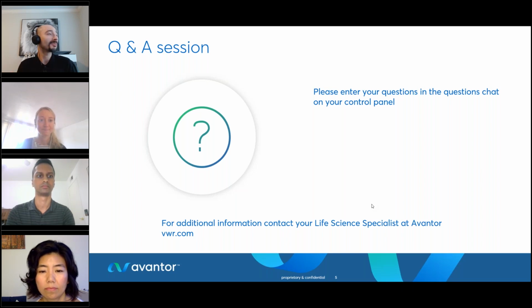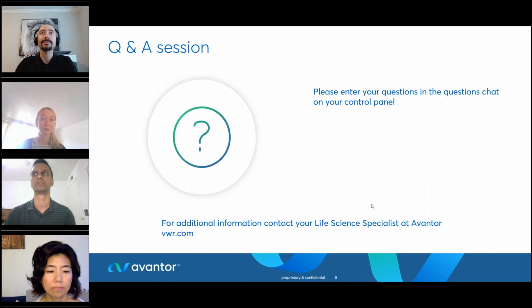Thank you. And we have time for just one last question. Can the workflow be used the same way for large BACs or bacterial artificial chromosomes? Sarah, would you like to take that one? Yeah, so that's a good question. Unfortunately, the workflow hasn't been tested with BACs yet, and I think there are a few tweaks that we need to make to ensure that it does work with genomes of that size. But it is something that we know there's interest in the community about. So if there is interest, then we would look to add it in the future.